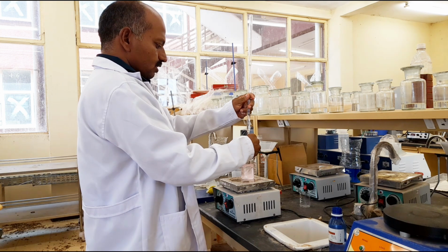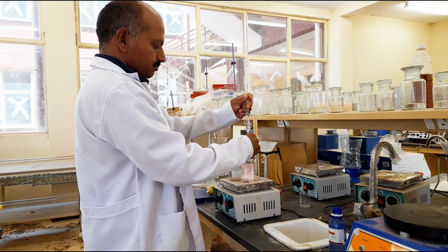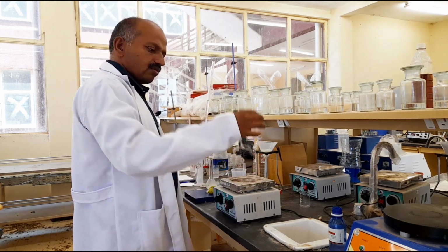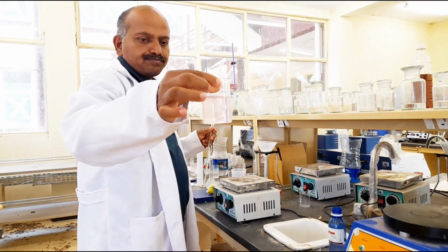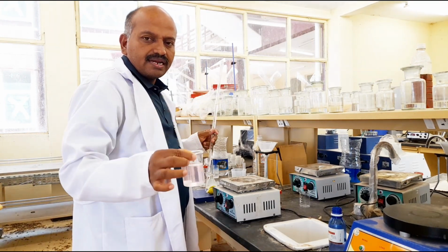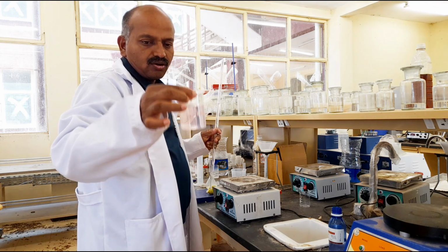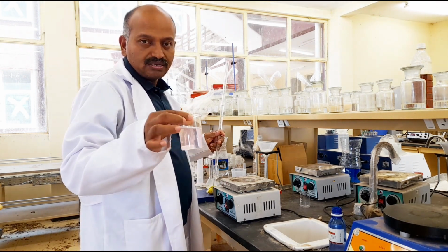You can see slowly the color is changing. Yeah, now the pink color is obtained. So this is the end of the reaction. The colorless solution converts into pale pink because in the basic medium phenolphthalein exhibits pink color. That is why the color changed from colorless to pink. Now the solution inside is completely neutralized and converts into basic medium.